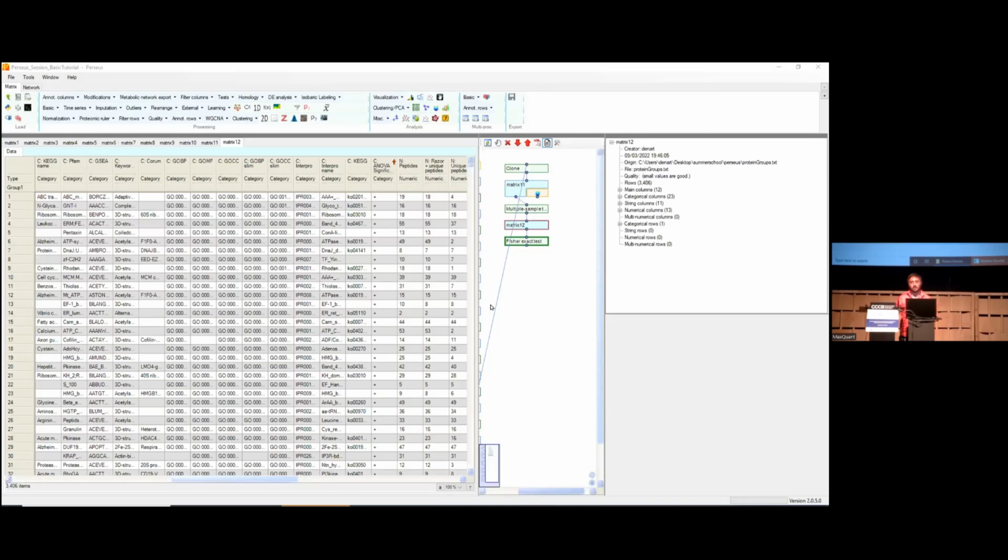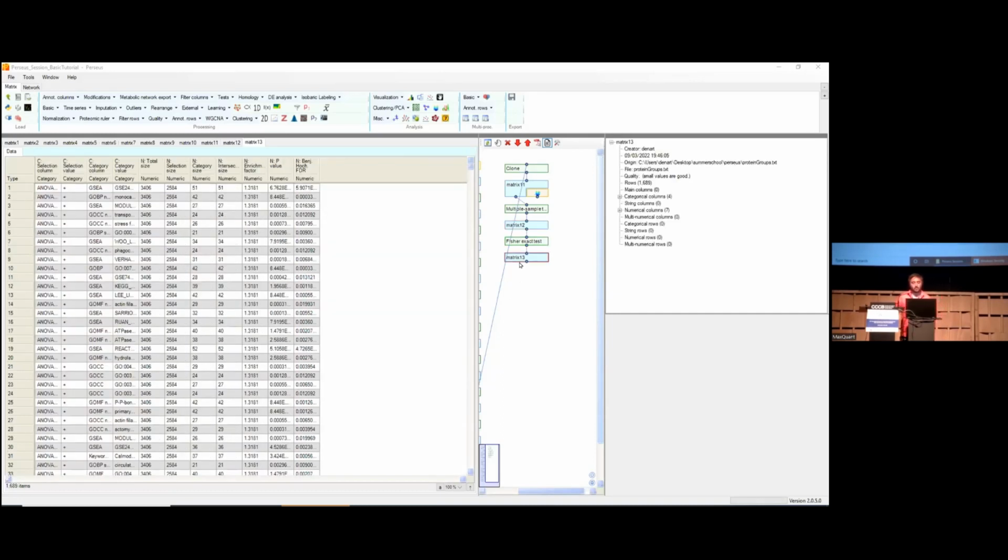So what you want to see here is, if you have a differentially expressed protein or a set of differentially expressed proteins, whether this differential expression is associated with any annotation. You want to see if the set of differentially expressed proteins shows an enrichment or a depletion of a given annotation. This will tell you if a GO label or a KEGG entry is enriched or depleted in your data. Okay, perfect. So now we have the results.